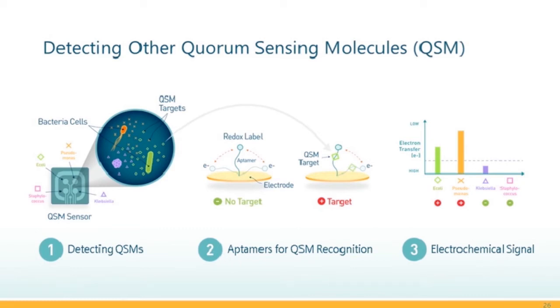On the far end of the optomer sequence is an electroactive molecule or a redox label. And it's like a tether ball moving around in solution, bound to the surface. Each time it interacts with the surface, it can transfer an electron, and we measure that current that gets produced.